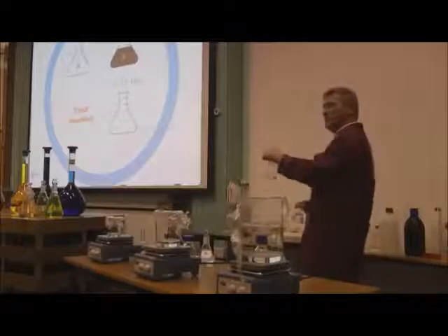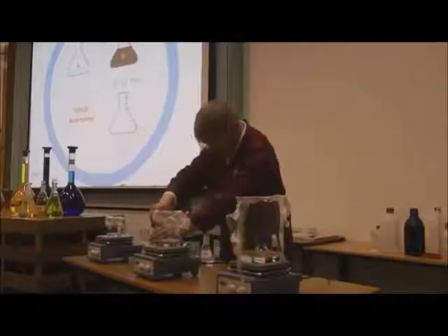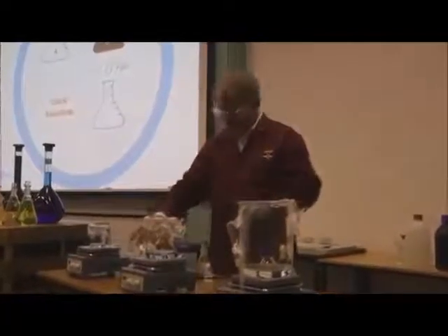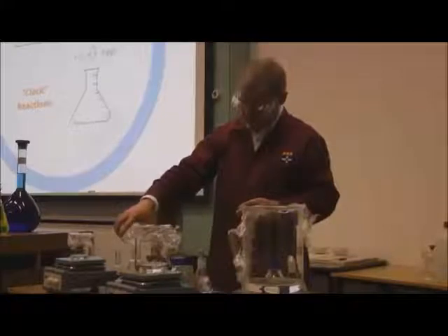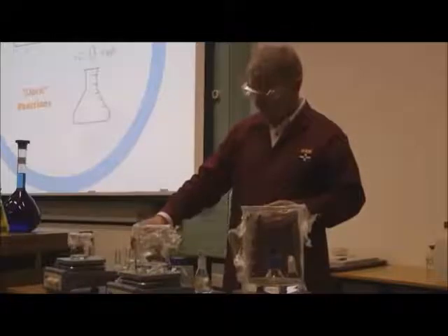So I've made some that have got a bit more of an interesting colour change. So I've got to make sure I've got A and B plot. And C, we're going to add, which is actually B in this case.